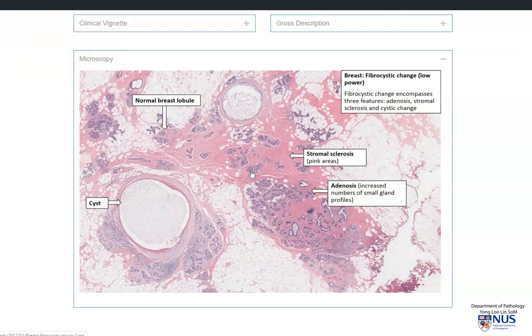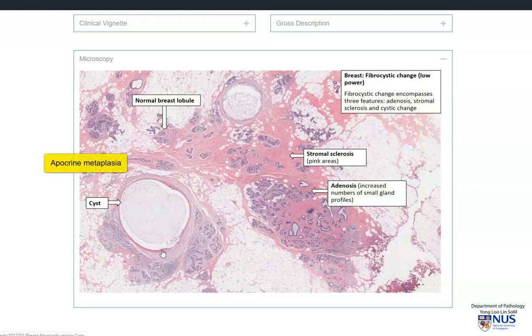Histologically, we would usually see three main changes. We can see the formation of cysts, as you can appreciate here. The cysts may be lined by flattened epithelial cells, or in this instance the cells are quite pink, and this is evidence of metaplastic change known as apocrine metaplasia. This is very common in the cyst lining cells in fibrocystic change.